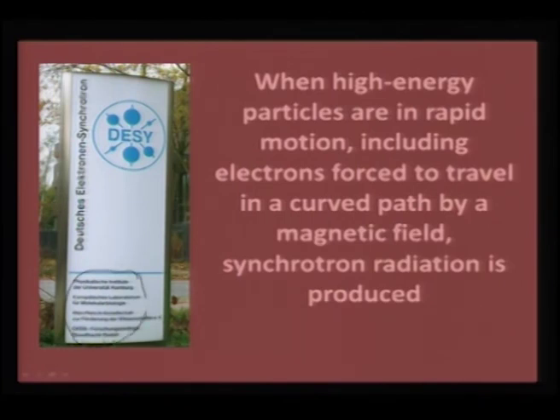Most of the research institutes and foundations, including government, pitch in to sustain such a major facility. Therefore, this is not simple stuff. Definition of a synchrotron, we can take it from here. When high energy particles are in rapid motion, including electrons, they are forced to travel in a curved path by a magnetic field, which we call the booster, and then synchrotron radiation is thus produced.